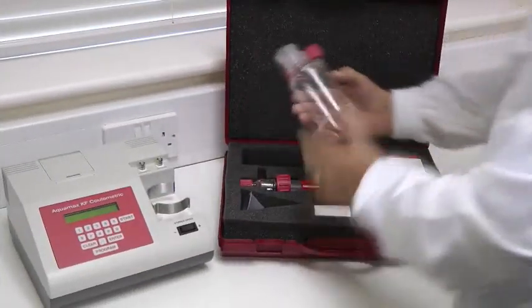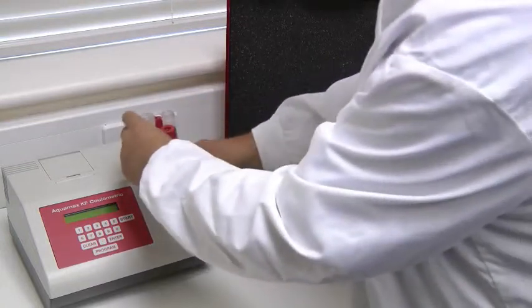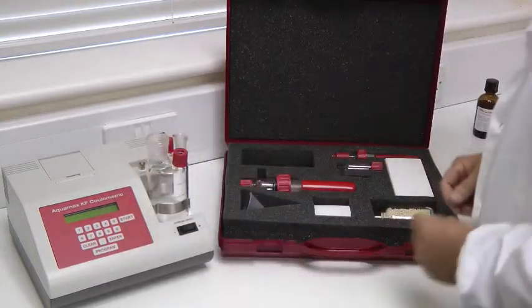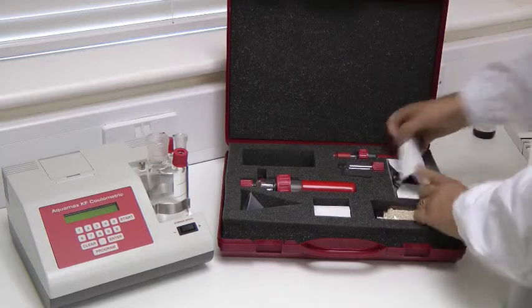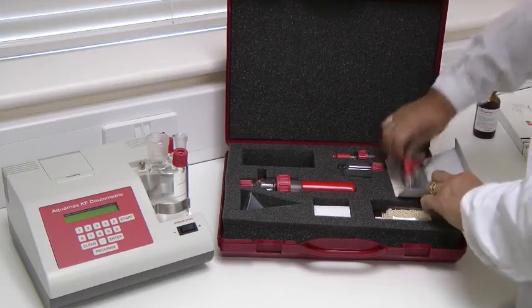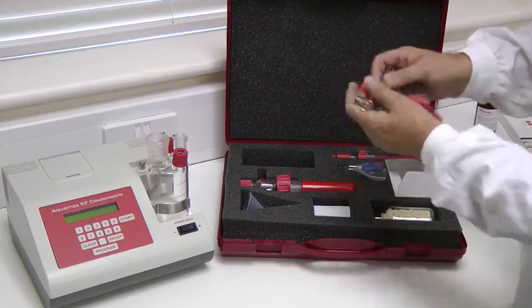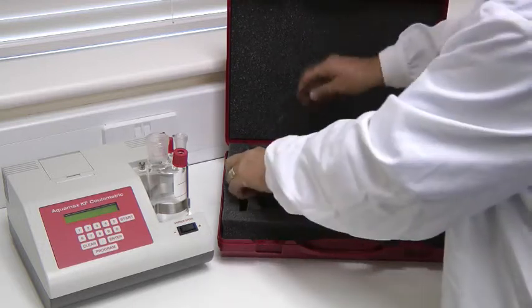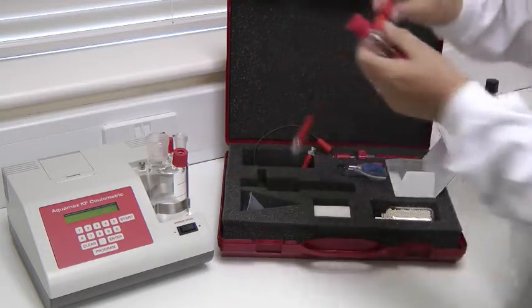To assemble the glassware, start by placing the titration vessel in the holder. Next take the electrode leads and attach them to the generator and detector electrodes and then locate the electrodes on the titration vessel.